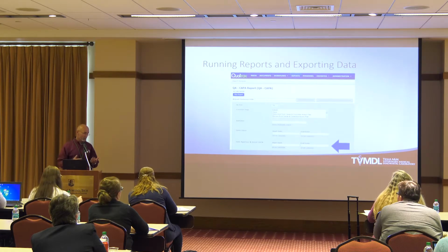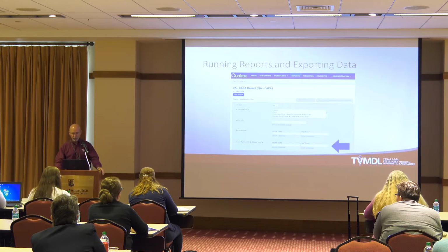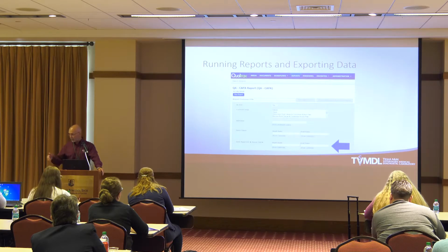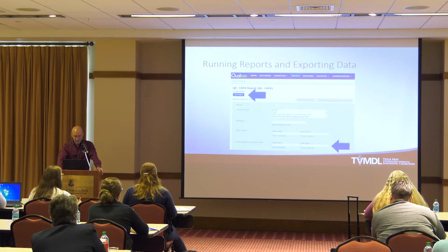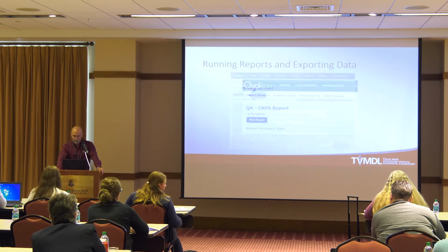So typically when we're running a management review, we just back up 1 year. If for some reason the managers or whomever just wanted to see 6 months, 2 years, we can filter that down to a specific date range. But for our reports, we go year to year. So for instance, I'll go April 1st, 2018 through April 1st, 2019 and select run and just pull that report out. So once you get your dates in or whatever type of filters you've set up, hit run report.